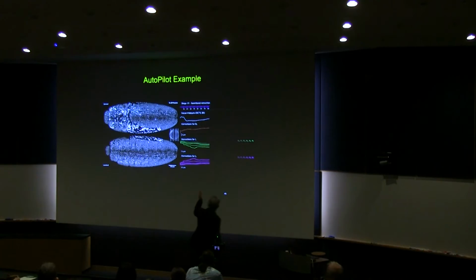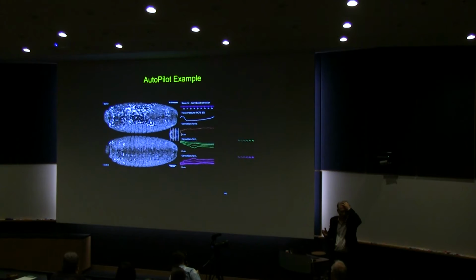So basically this represents the next step up in light sheet microscopy, because it's tuned. I mean, the other really cool thing about it is that you can turn it on and go home and come back 24 hours later, okay? You don't have to come back in the middle of the night to adjust it. It's adjusting itself, okay? All right, so again, much beloved by Keller's postdocs.